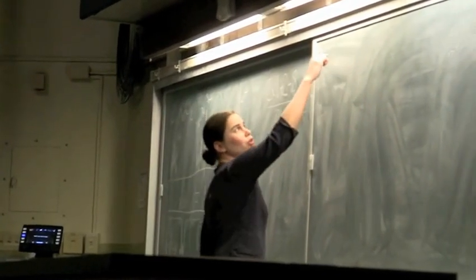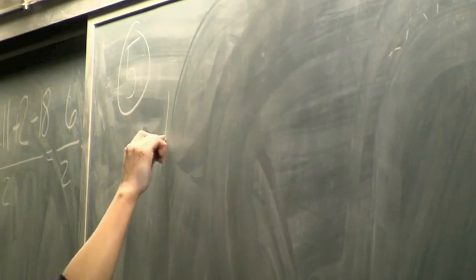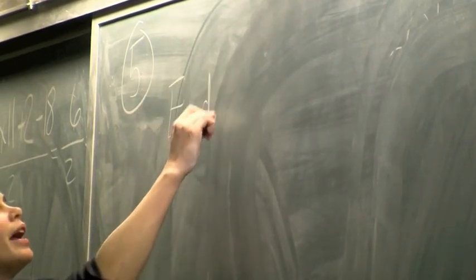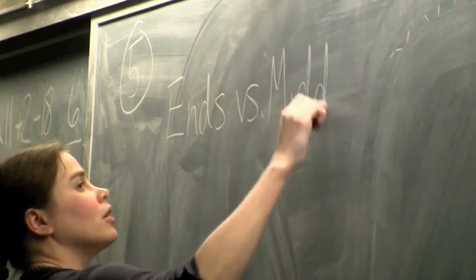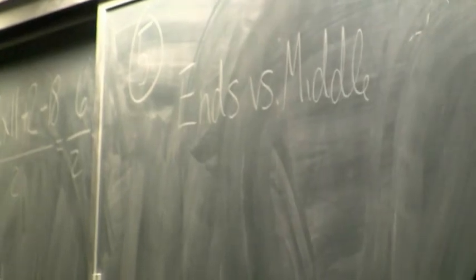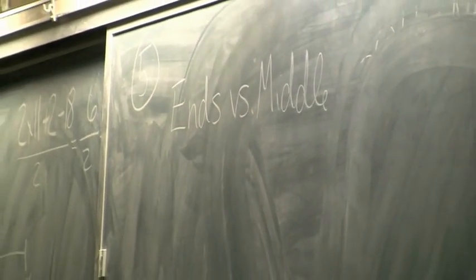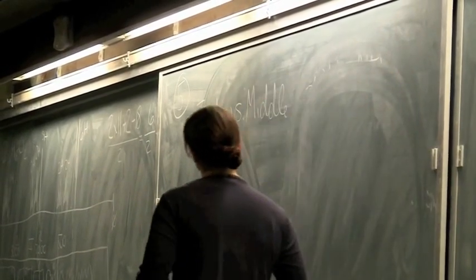So when you're looking to put this together, I call these candles. There's places you can start to work, places you can start to look at things, and things you want to start. This is kind of the tough part because they're all different. But things to think about is ends versus middles. You can't put 2 ends together. If you put the two CH3s next to each other, there's no place else to put the rest of the molecule. You gotta have the ends separate from each other.